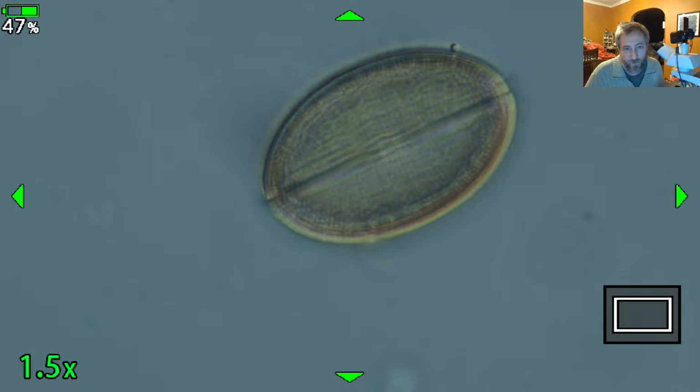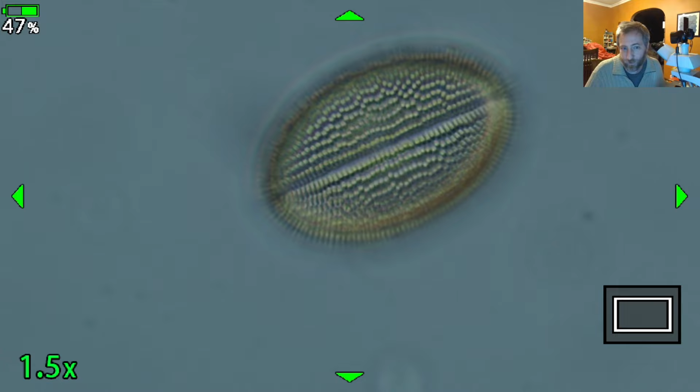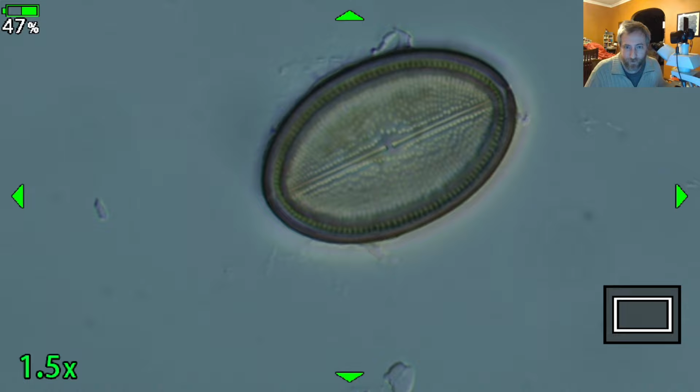And so if we focus all the way through, we can see that on one side, it looks like this. It's like we got a quarter and we can see the head side and the tail side, right? If we focus through it. So because we're looking through them and they're made out of glass, basically, or opal and silica, we can see what's on the other side. So this one has this shape on one side and this shape on the other side, right? So totally different valves. And the valves can fall apart. So you might find just the araphid valve or just the raphid valve and not know that they go together because there might be other things that are egg-shaped in your sample, for example.